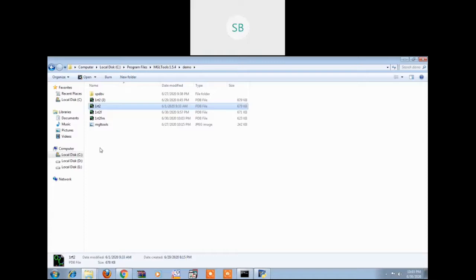So during the process of removal or freeing up the protein from its co-crystal, there is a change in the coordinates. That means you need to reshape the coordinates. So you need to refine the coordinates, and for this very purpose, energy minimization needs to be carried out. So the next step is, once the protein is freed up from the co-crystal as well as water molecules, the coordinates have to be refined.